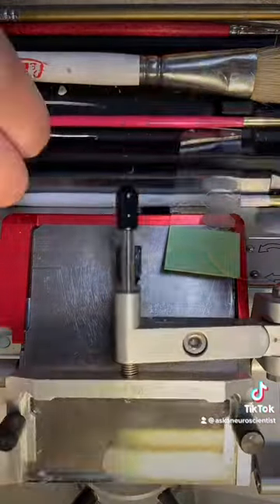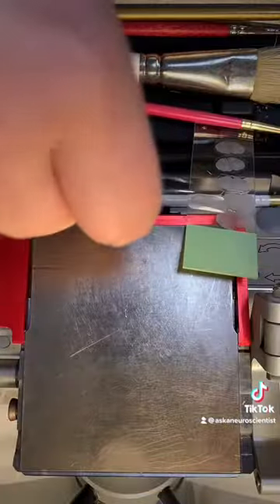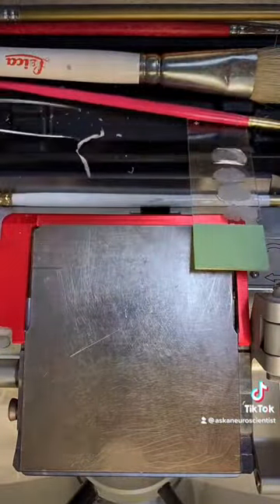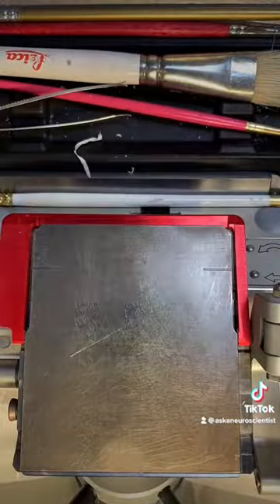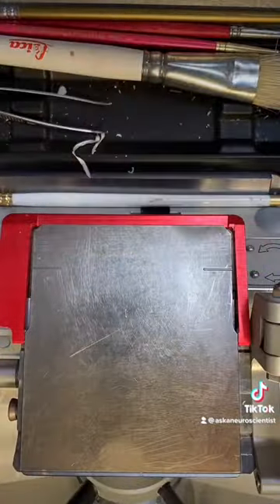I know this is going fast but you can pause or slow it down on your own. This is how I put my sections onto my slides. The key thing here is that you need to be grabbing the OCT and not the brain, or else you'll damage the brain. What's happening here is that the slide is at room temperature and the brain is at negative 22 degrees Celsius, so these sections are actually melting onto the slide — and that's how they stick.